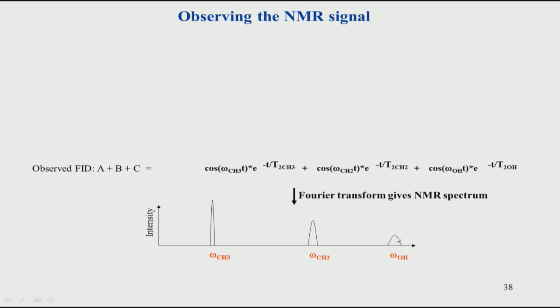A spectrum consists of a frequency axis, which is the x axis, and your y axis is your intensity. Now, remember the intensity is basically proportional to the number of hydrogens. So, there are 3 hydrogens, so this will be 3 times. But one thing, before we look at the height of intensity, when we talk about intensity in NMR, it means the area. Suppose I take the area of this peak here, this is like a triangle. In reality it is not a triangle, but let us say it is like a triangle. If I take the area of the peak here, that area will be 3 times the area of this peak here.